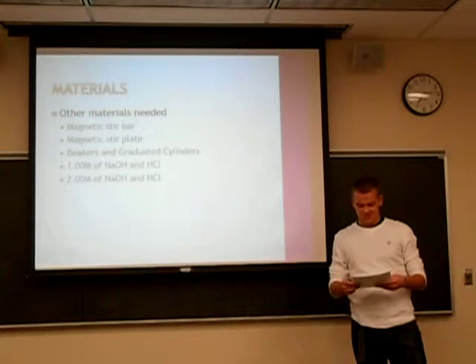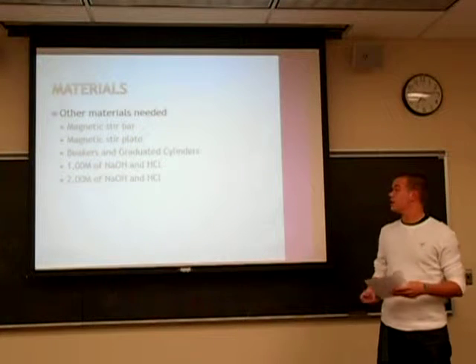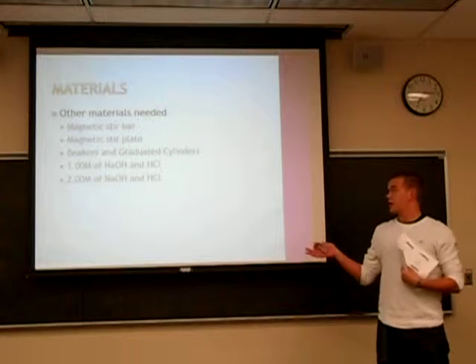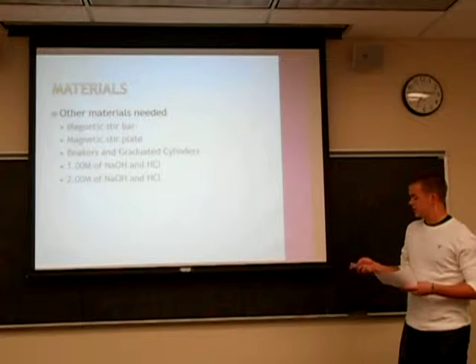The other materials that you need are the magnetic stir bar, the magnetic stir plate, beakers, graduated cylinders, 1.00 molar NaOH and HCl, and 2.00 molar NaOH and HCl.